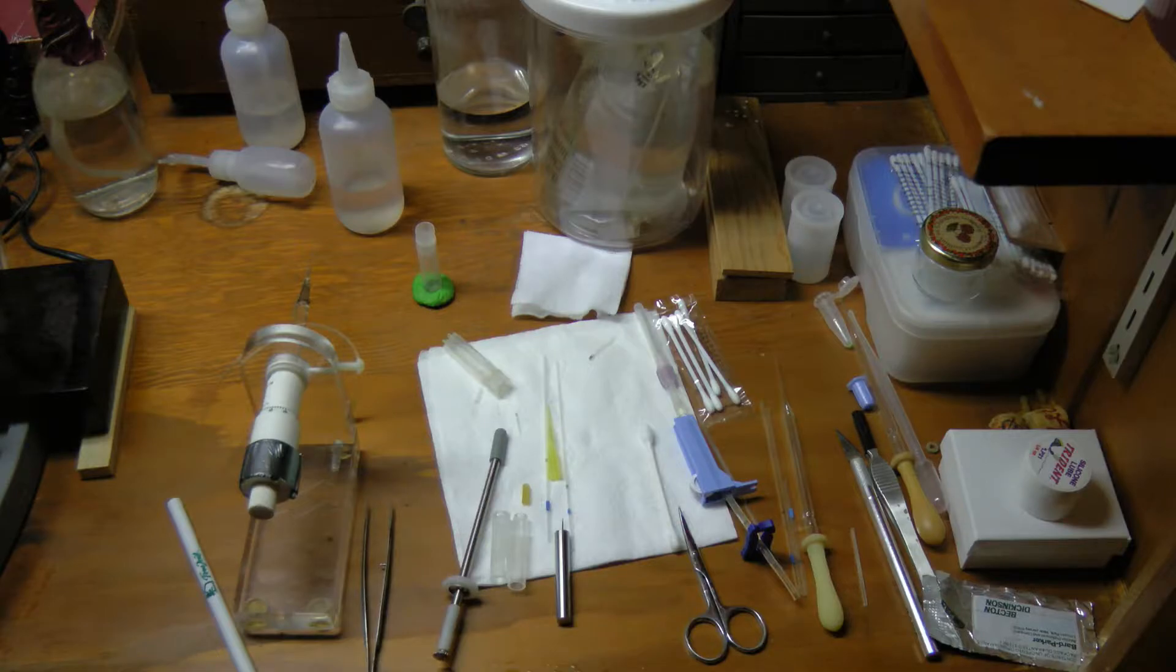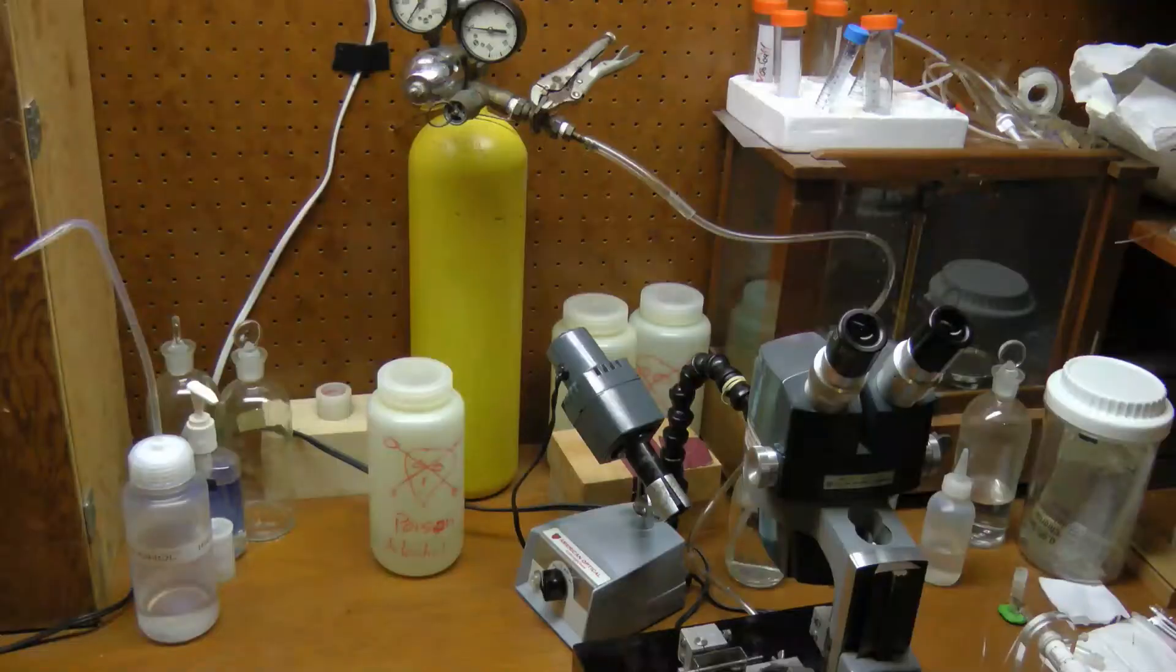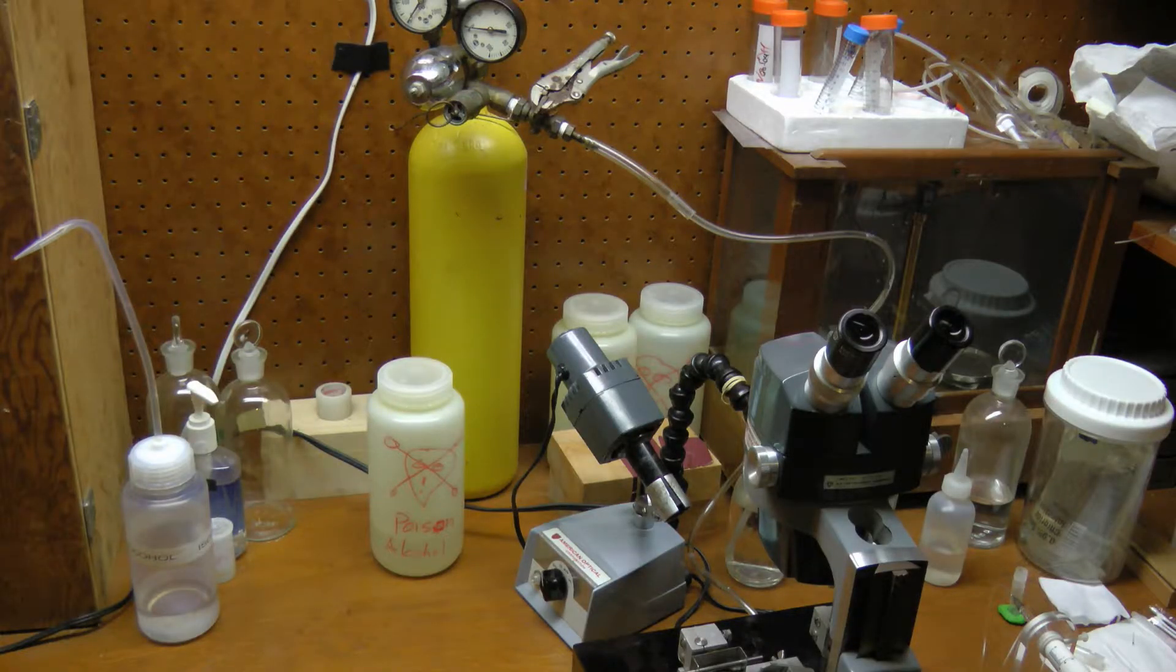It takes a variety of tools to do the insemination. It reminds me of a dentist's tray. The yellow cylinder contains carbon dioxide, which will be used to anesthetize the queen.